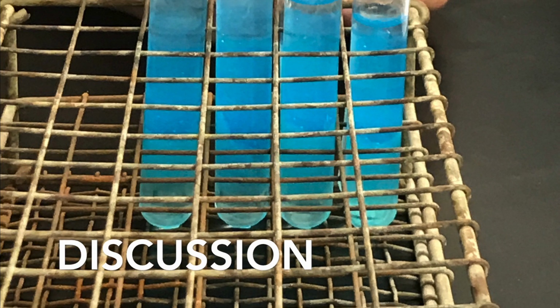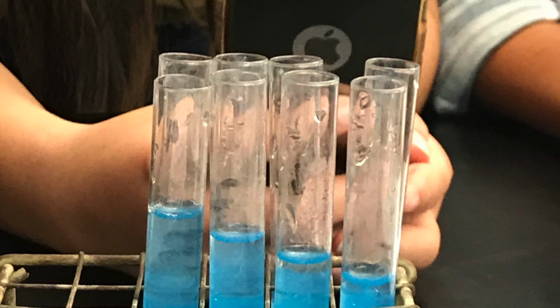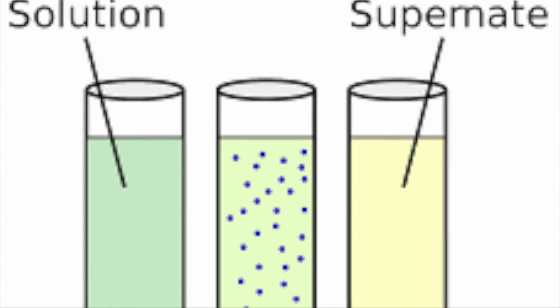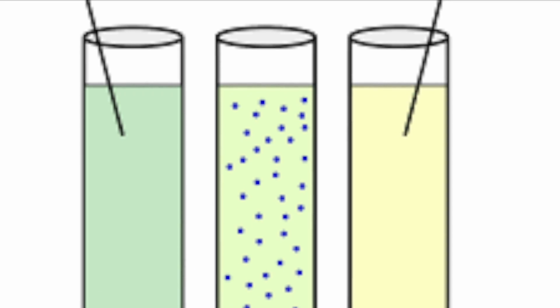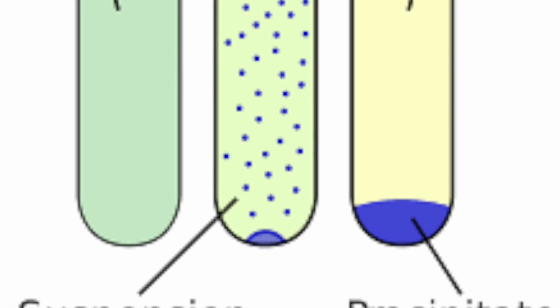The result from the lab showed that the precipitate levels off on test tubes 5, 6, 7, and 8. This is because there is no more copper sulfate to react with and make more precipitate. Consequently, there is potassium hydroxide supernatant left over above the precipitate.